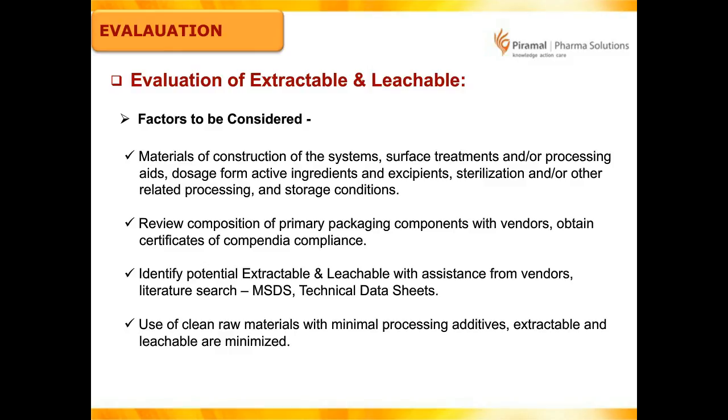So yes, during the extractable study, we forcefully do it, and we try to see whether these extractables can be evaluated by the technique which we will be using during the leachable study. So for all the drug products, we need to have this extractable study done, irrespective of the same rubber stopper being used for all different drug products. This is how we try to guide all our clients when they come to us with their queries. These are the potential things we evaluate, and we try to give this kind of solution to all our clients.